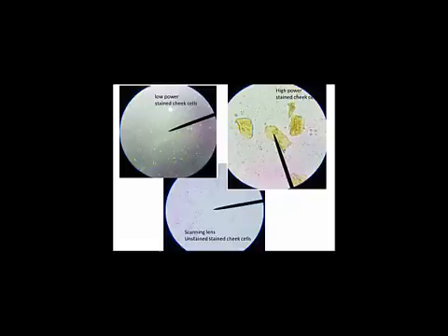For example, if you've got a bunch of dust on your ocular, then you will end up seeing that. So, one thing that students will do is sometimes they'll focus in on this thing thinking that's correct, when really this is the thing to focus in. So always know what you're looking for, right?